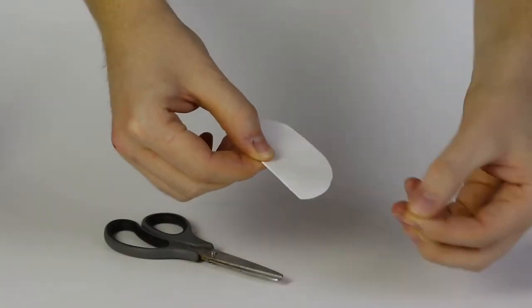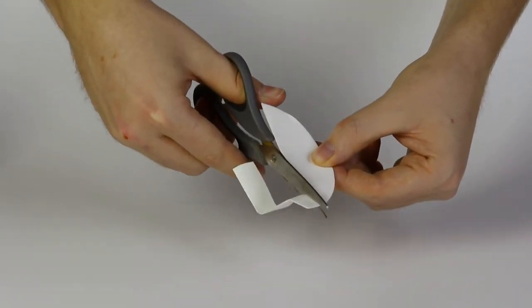Cut a piece of filter paper as shown. Fold it in half and hold it with the tweezers.